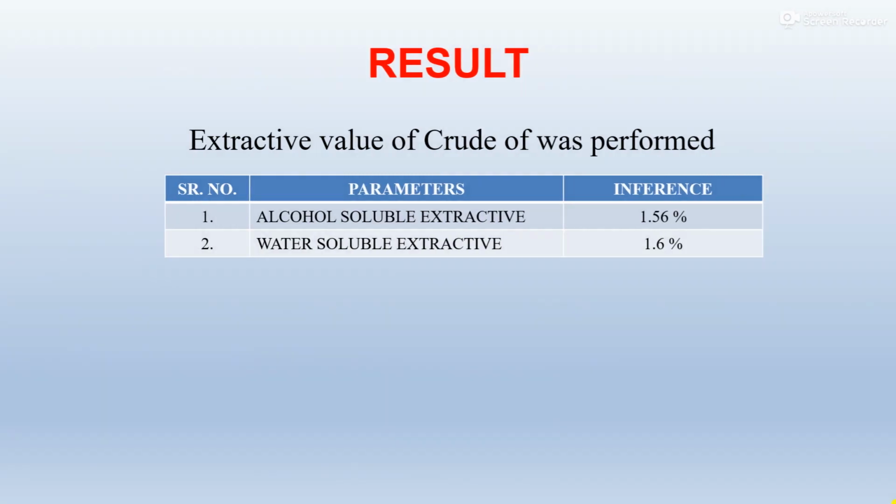So here are the results. The extractive value of the crude drug was performed. The alcohol soluble extractive value obtained was 1.56%, while the water soluble extractive value obtained was 1.6%.